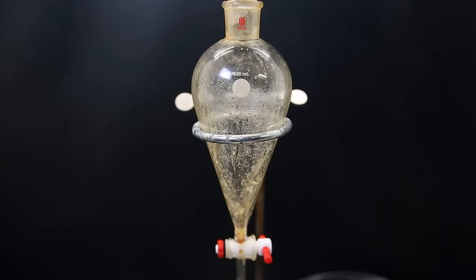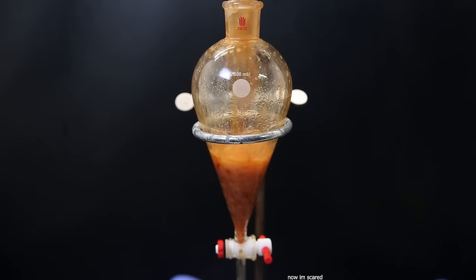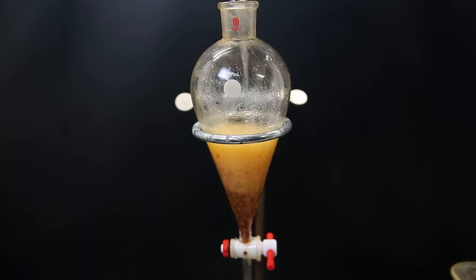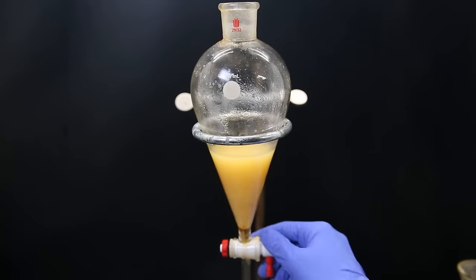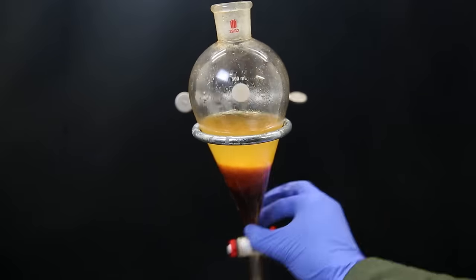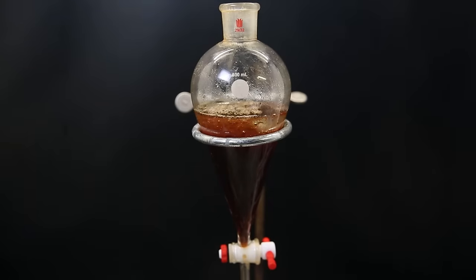Oops. Let's do that again. I move it all to a separatory funnel and separate the layers. I then extract the remaining water layer once with DCM. I return the combined DCM extracts to the separatory funnel and wash it once with some water. And then once with some brine.